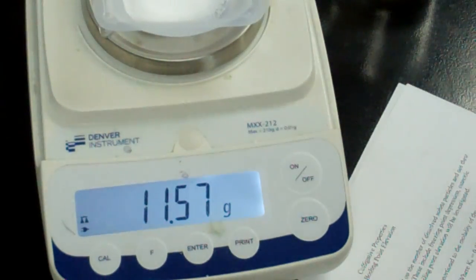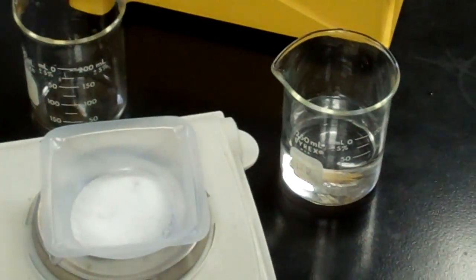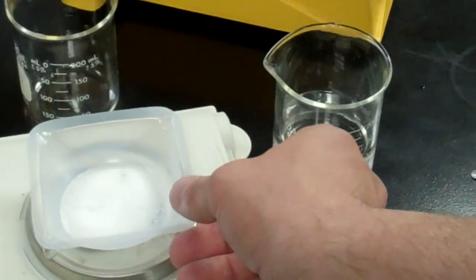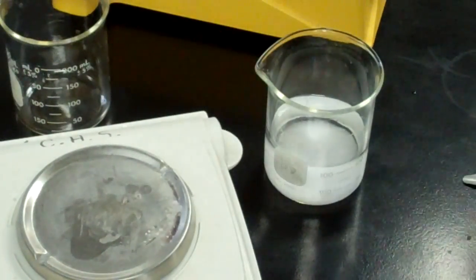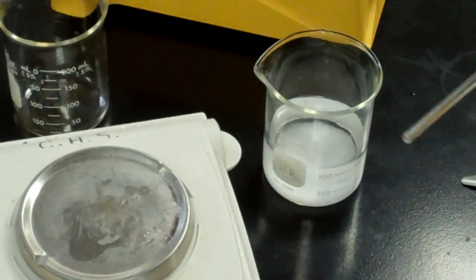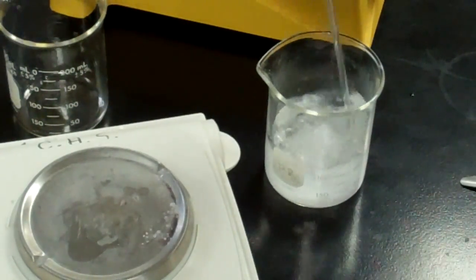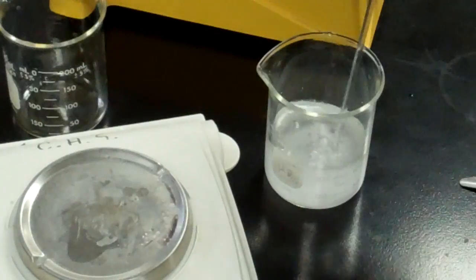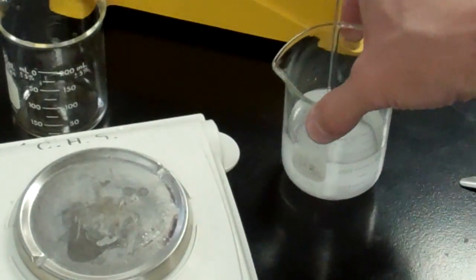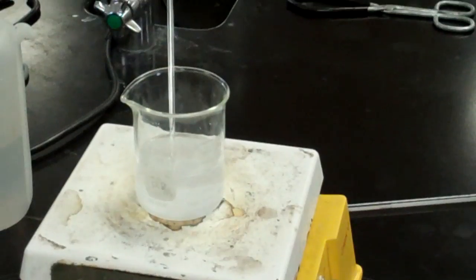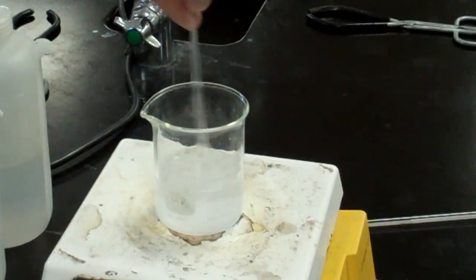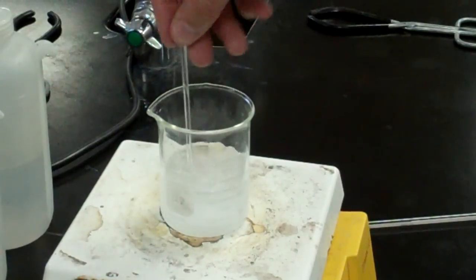And so that solute we will now place in our beaker of water. Remember this has 100 grams of water in it. Place the salt in there and we will get a stirring rod which has been provided for you as well and we will stir that so it goes into solution. It might not go into solution right away, in fact as you know heating it up should help the solvation process. So we will put that on our hot plate there and we will start heating it. All that salt will eventually go into solution.